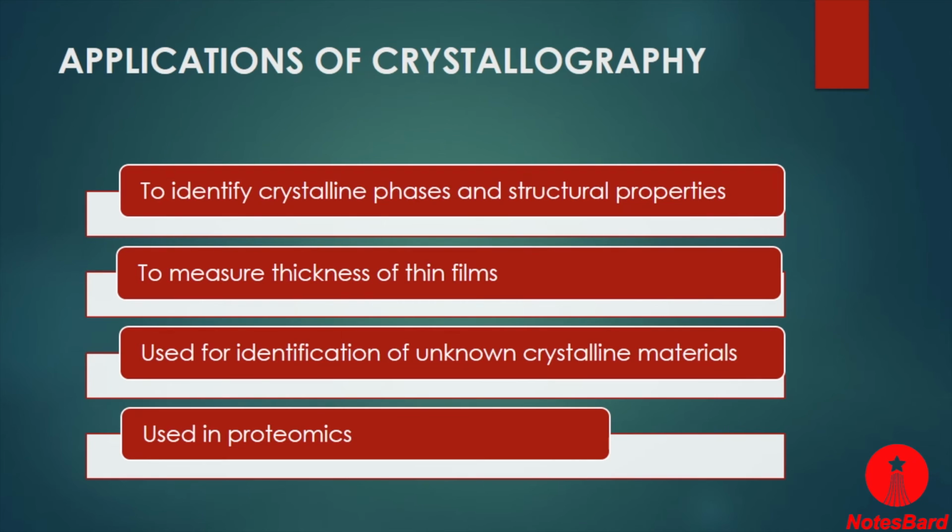The method is also used for identification of unknown crystalline materials, different types of inorganic materials or minerals which are found anywhere. It is used for the identification of these materials in industrial applications. In industries it is widely used in fields like geology, environmental science, material science and many other fields. This method is used for the determination of unknown solids which are very critical to studies.